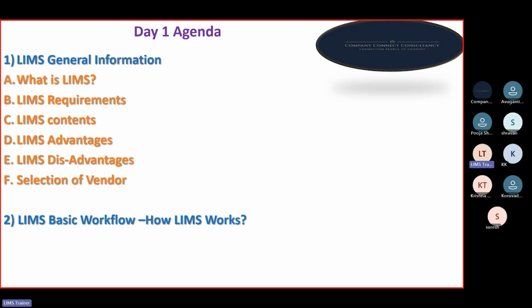They know how to do the analysis, they know the workflow of the sample. That is their functional knowledge. And regarding software knowledge, if they are already working on the software, or have knowledge about it, this is beneficial for the IT industry because they will act as a bridge between the client and the IT company.